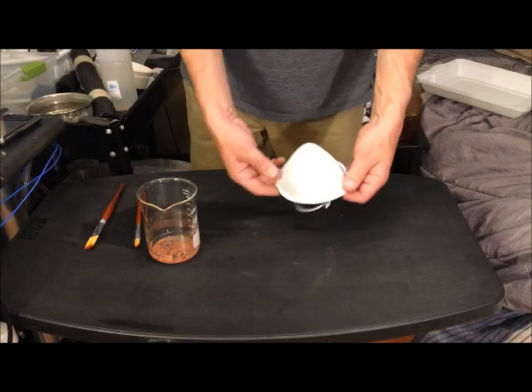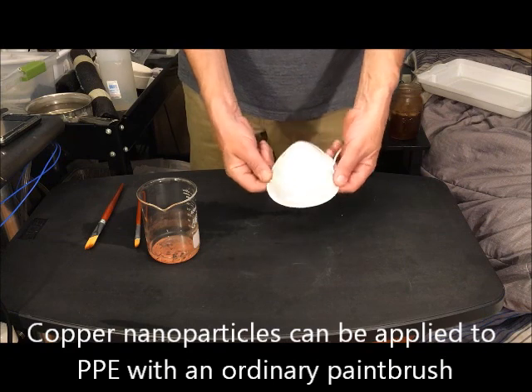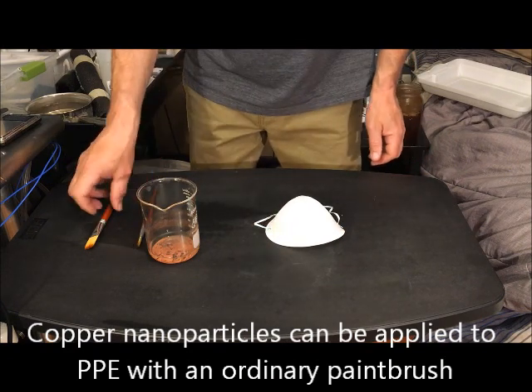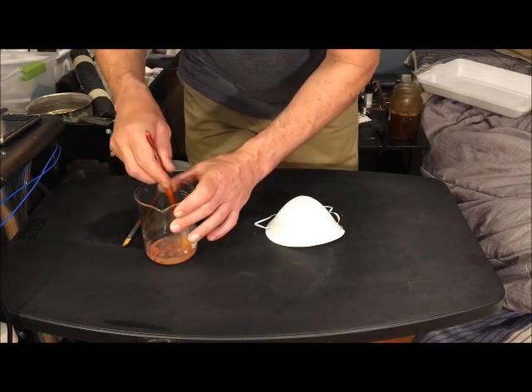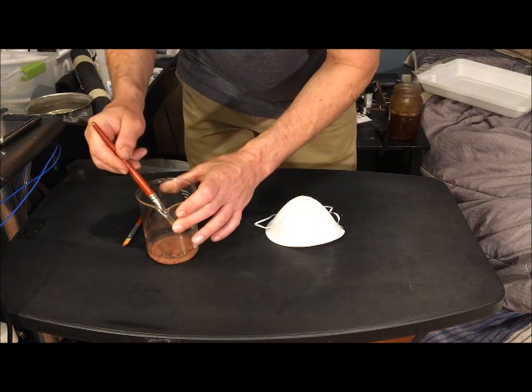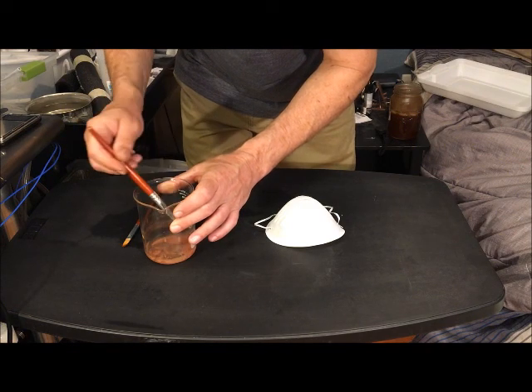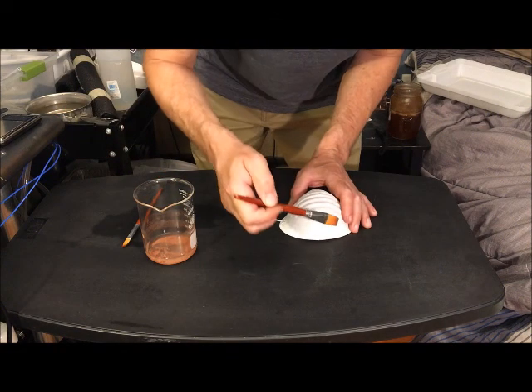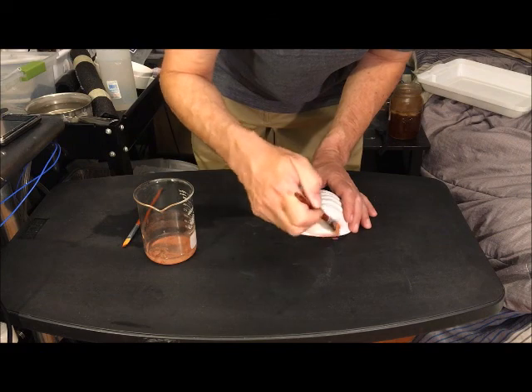I'm going to apply the copper to a face mask using a simple paintbrush. You can simply paint it on by dipping the paintbrush in the solution or suspension and brushing it onto the material. Make sure that the copper adheres to the brush before painting, otherwise you'll just be painting water on. Continue doing this until the entire outside surface is covered.